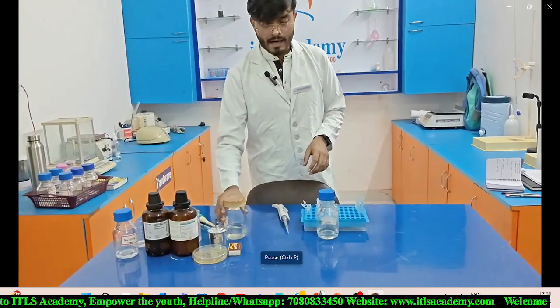now we are going to add 0.5 ml of chloroform and phenol in each eppendorf. So I already set it at 500 microliter. Now I'm going to add 0.5 ml of chloroform in each eppendorf. So here we go.